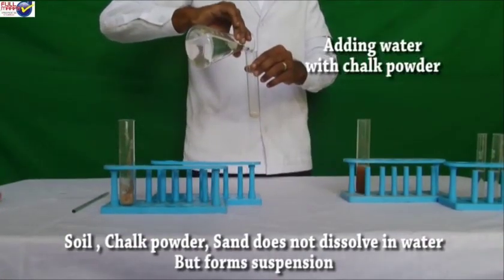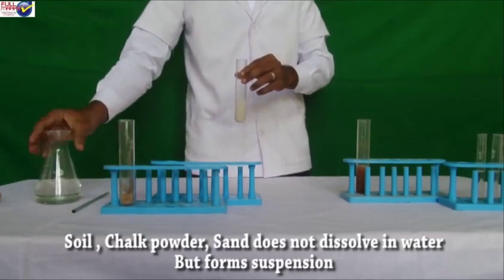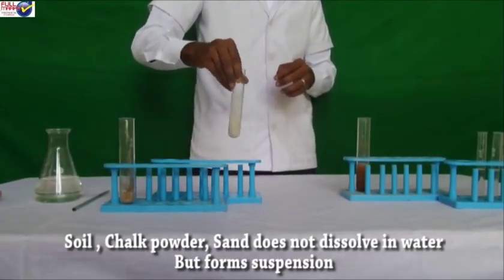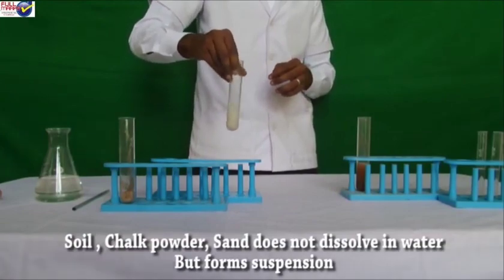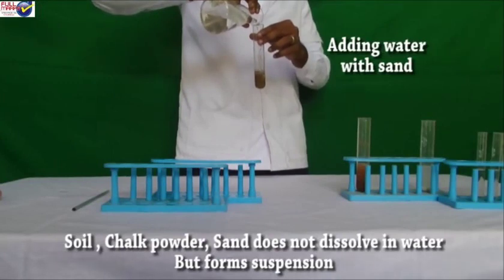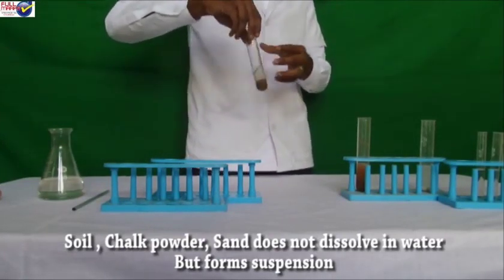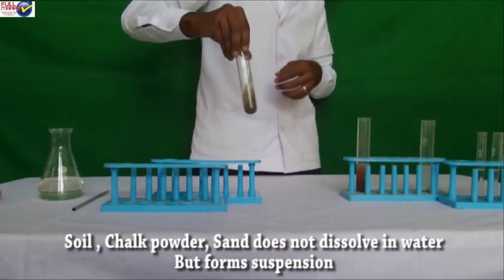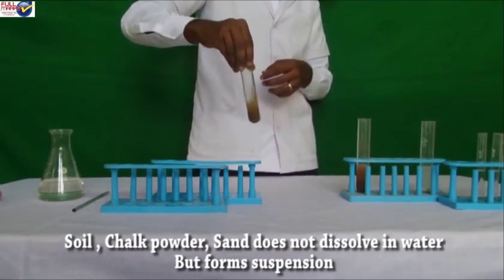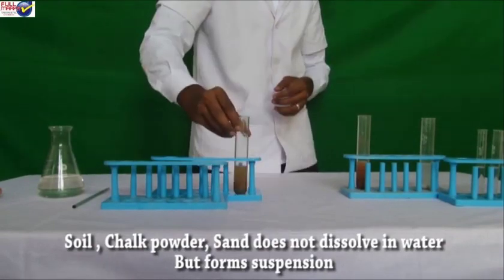Suspension of chalk powder in water. Take 2 to 5 ml of distilled water in a test tube. Add a pinch of chalk powder in it. Stir well and record your observation. Suspension of sand in water. Take 2 to 5 ml of distilled water. Add half a pinch of fine sand in it. Stir well. Keep the test tube on the stand and record your observation.